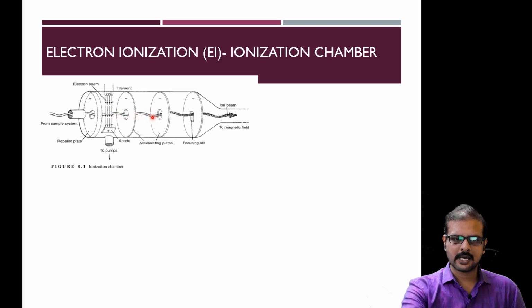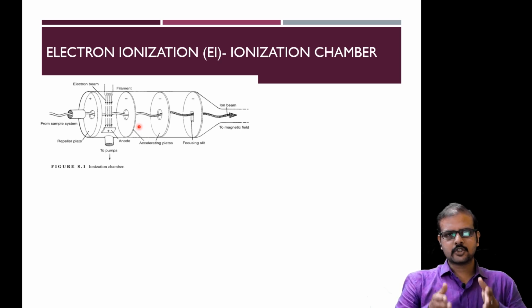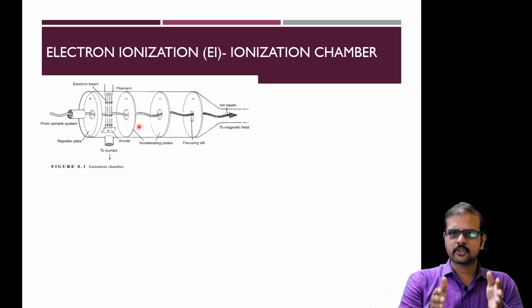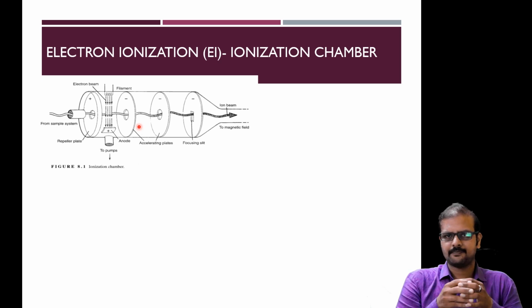These are called acceleration plates. What is the use of these acceleration plates? They ensure that the molecular ion does not collide or fall apart.